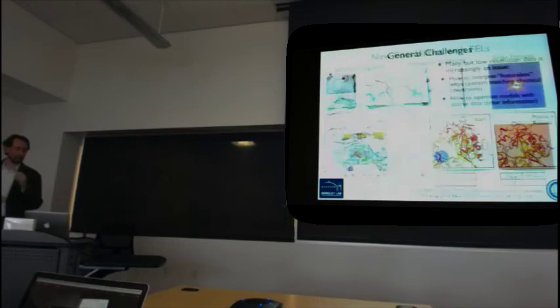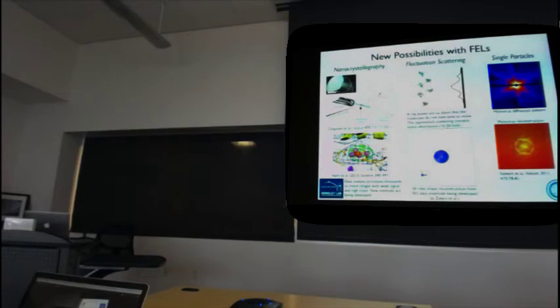So I think there are a lot of new possibilities with FELs. This workshop will be focused more on the diffraction areas such as nanocrystallography, but things like scattering experiments can potentially benefit greatly. People like Peter Spart and others are developing methods in that area. And we shouldn't forget the original idea behind the FELs for biology, which was single particles. I think there's slow progress there, but maybe that works out eventually.